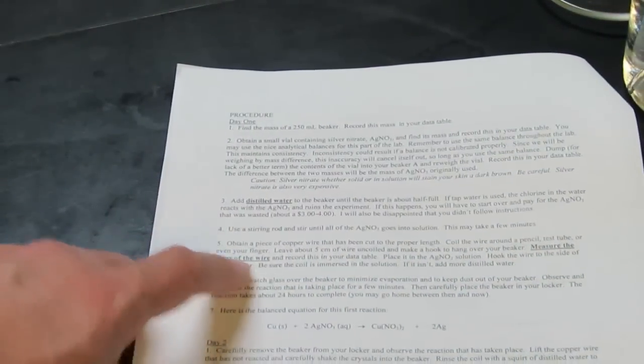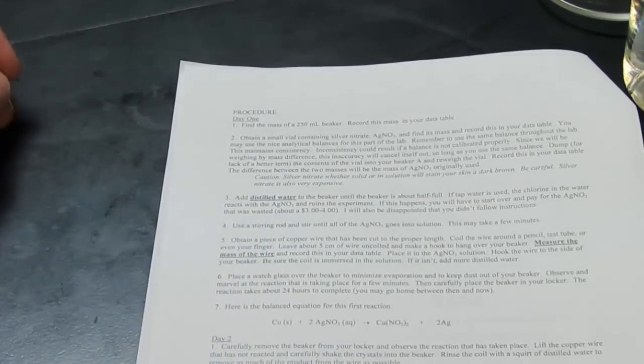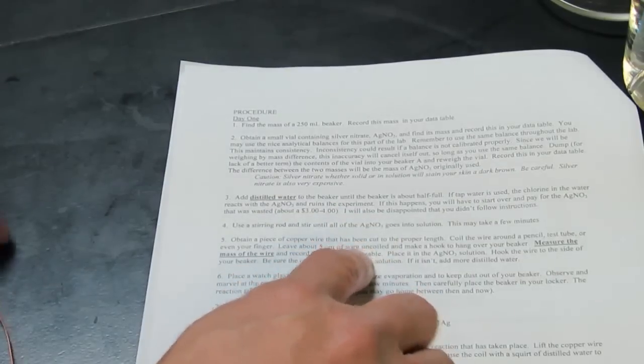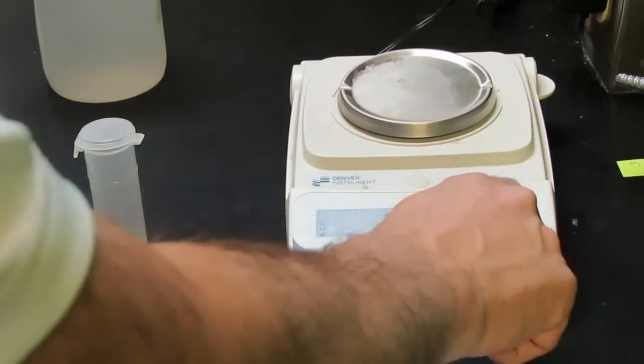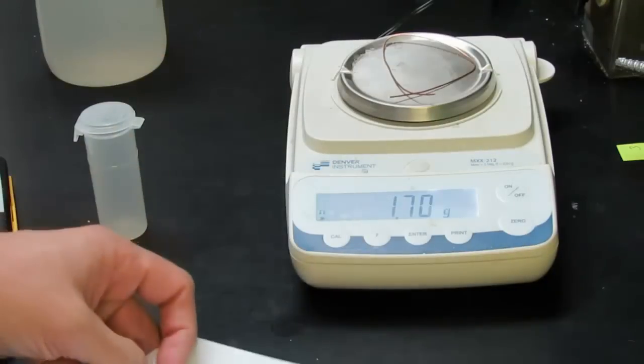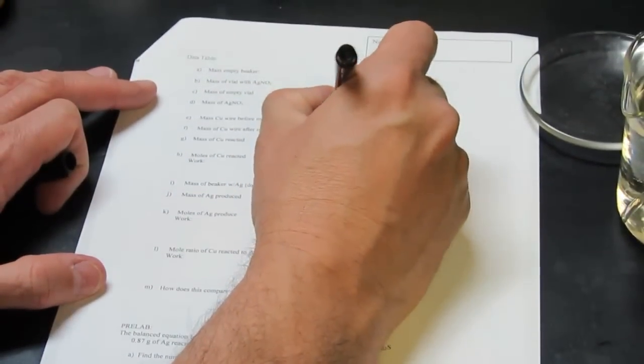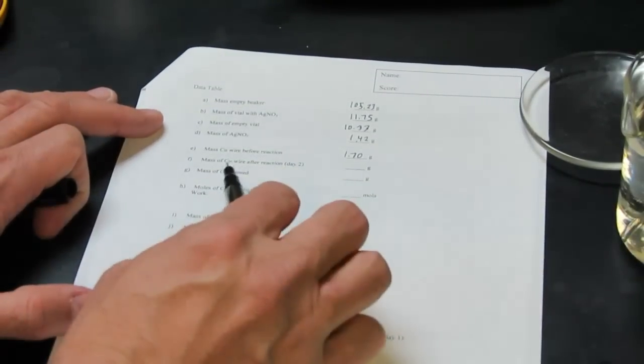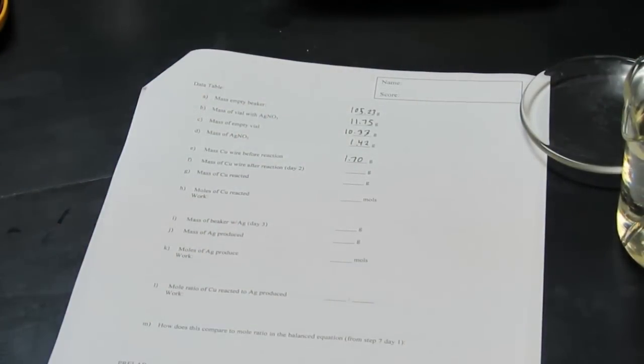We're going to get a piece of copper wire next. You can either use your finger, a pencil, or a test tube and wind that around. But before we do that, we want to measure the mass of the wire. We're going to put our copper wire on the balance pan. It looks like I have 1.70 grams of copper wire, so we're going to record the mass of the copper wire, 1.70 grams. Now the next blank on our data table says the mass of copper wire after the reaction, but you can't do that until the reaction is over with, and we won't find that until day two.